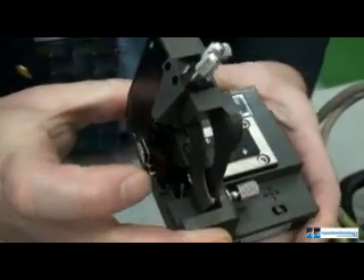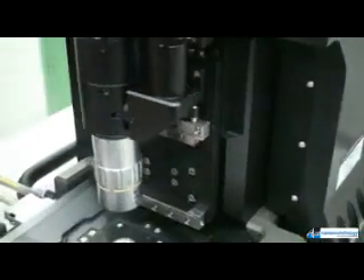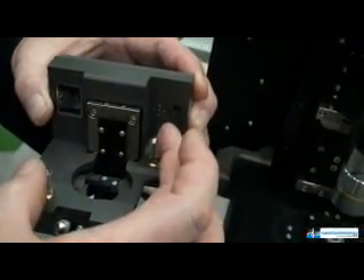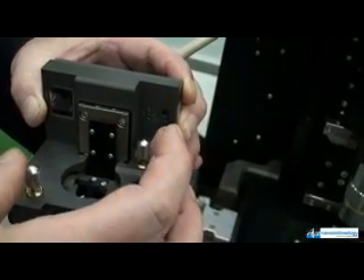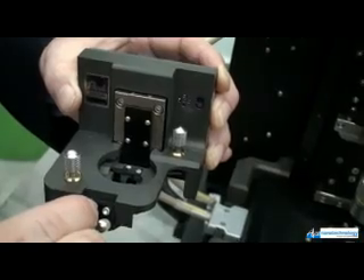The Z head fits onto a dovetail rail on the stage, making it easy to slide on and off to change the tip, which is mounted magnetically at the end of the Z scanner. For AFM feedback, laser alignment knobs on the top of the Z scanner are adjusted to fine-tune the position of the feedback laser for the AFM scan, or for an NSOM experiment.